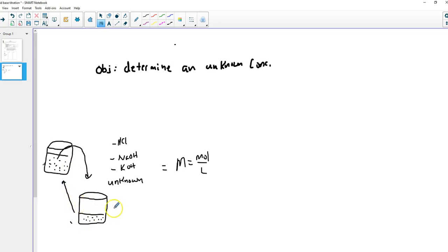Step one, when we take our sample, we want to measure it with some amount of accuracy. We wouldn't use a beaker to measure this out. We want to use a graduated cylinder of some sort. Those will be sitting out, so be careful measuring out your sample. There usually is a recommended volume, and maybe we'll highlight that when we get into the technique. That volume will be measured, so I'll know this amount. Now I have my beaker with my unknown substance.